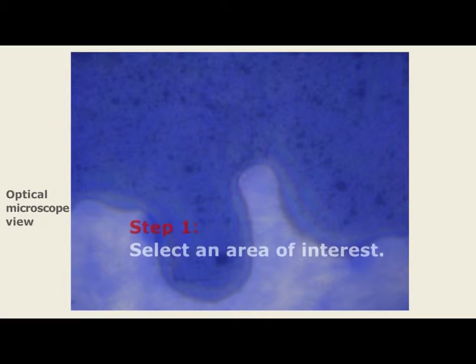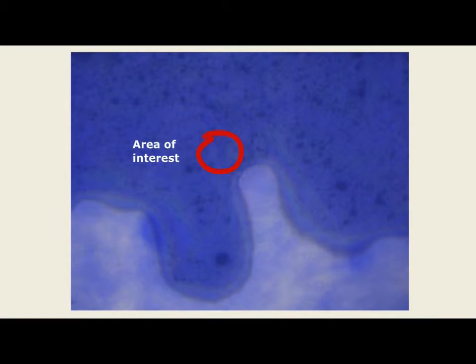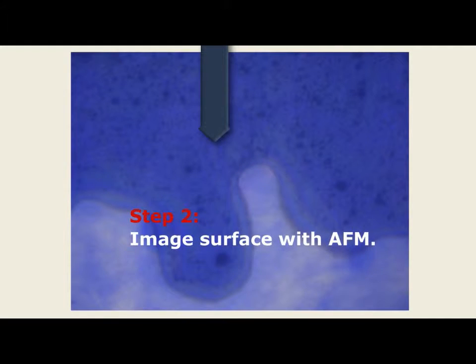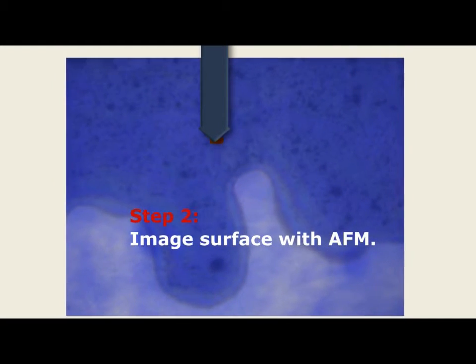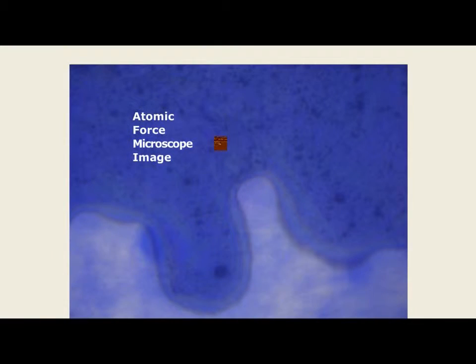We start out with an optical microscope view and select an area of interest where we want to perform a measurement. We bring the AFM tip down to the sample, start scanning the sample, and create a conventional atomic force microscope image.